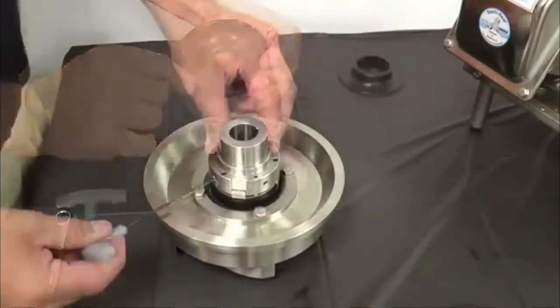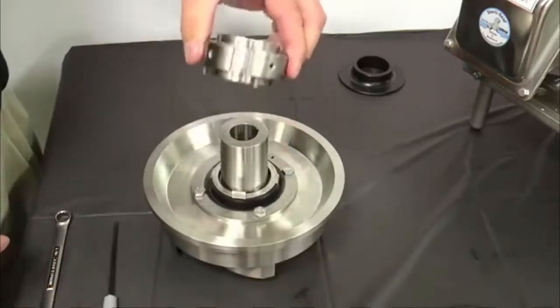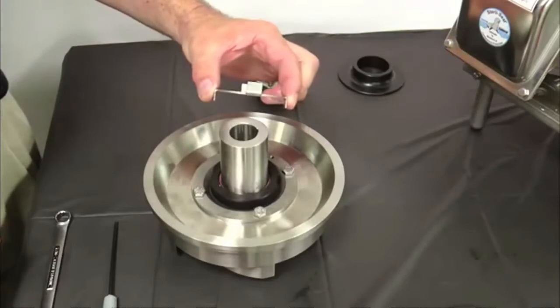Remove the deflector. Loosen the two set screws in the spring retainer and slide the retainer and washer off the shaft. Save the three springs.